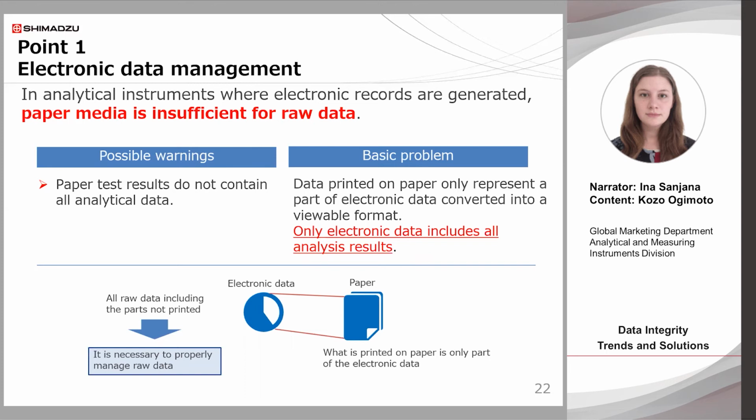However, in the case of an LC, the printed test data such as sample information, chromatogram peaks, and quantitative results will only be a small part of the overall data obtained in the analysis. If a small peak appears in the printed chromatogram, it's not possible to tell whether this is from noise or the presence of a compound just by looking at the paper copy. The user will have to open up the file on a PC and zoom in on the peak to check the retention time and peak shape accurately.